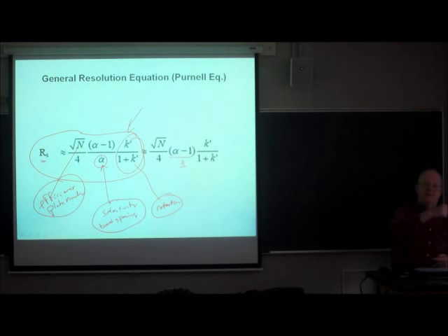I'm going to run it backwards. The first law of chromatography is, if you don't have retention, you can't get resolution. If k prime here is 0, it doesn't matter if you have a gazillion plates. And it doesn't matter if the alpha is really big. You're not going to get a separation if the first peak is totally, completely unretained. You have to have retention.